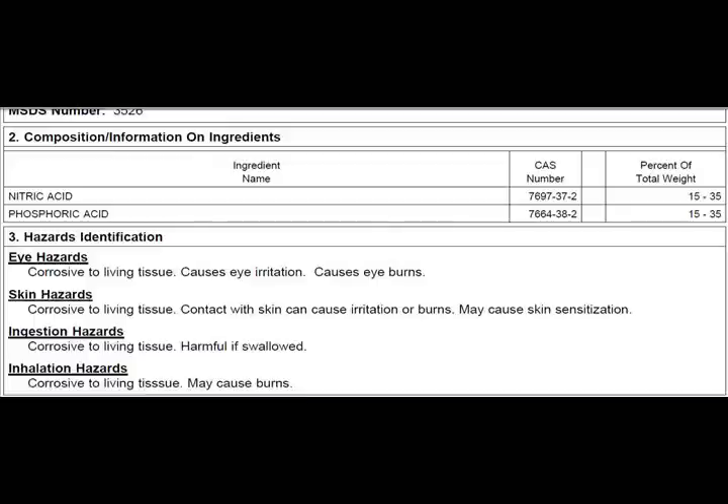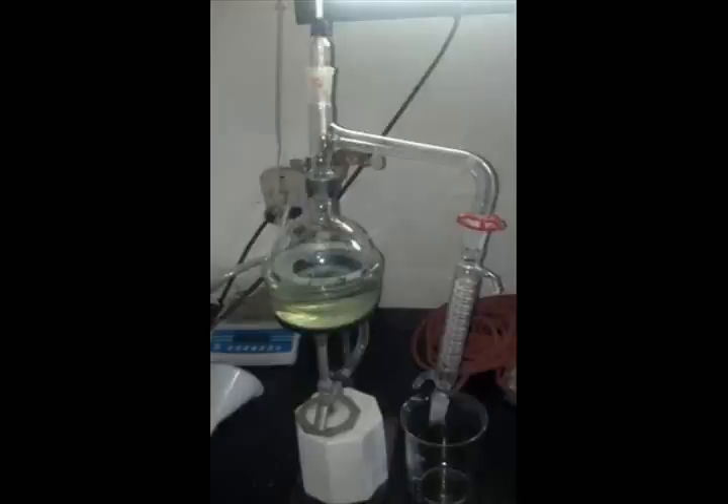The first thing I did when I got the etching solution was look up the MSDS to see the actual acid content, because on the back it said it contained phosphoric and nitric acid. The percent content on the MSDS was 15–35%. So I knew that one gallon would give me a theoretical yield of at least 580 milliliters. Multiply that by the 4 gallons I had and that's approximately 2.3 liters of nitric acid for $20 plus the cost of heating — not too bad.